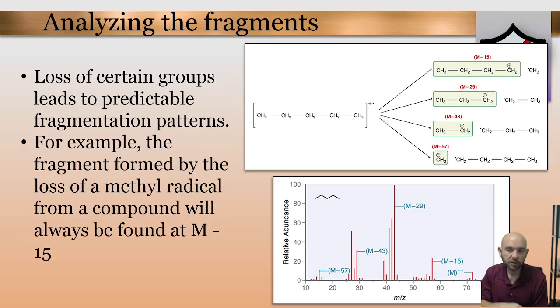Now that we've talked about the molecular ion and really pointed out everything we can learn from that and the group that it's located in, let's talk about the other peaks you're probably wondering about by now that appear further to the left side of the spectrum. Why do we see those other peaks and multiples of them, and why are many of them bigger than the molecular ion peak? We're going to answer all of those questions in the next couple of slides.